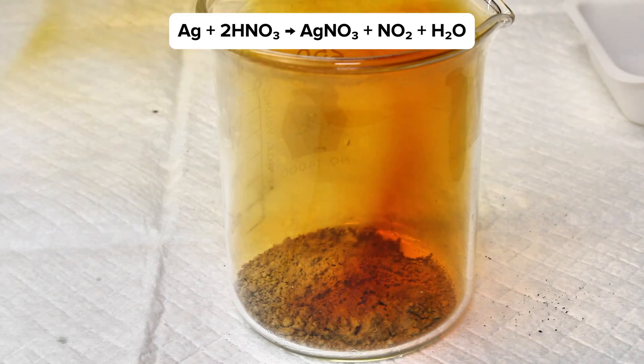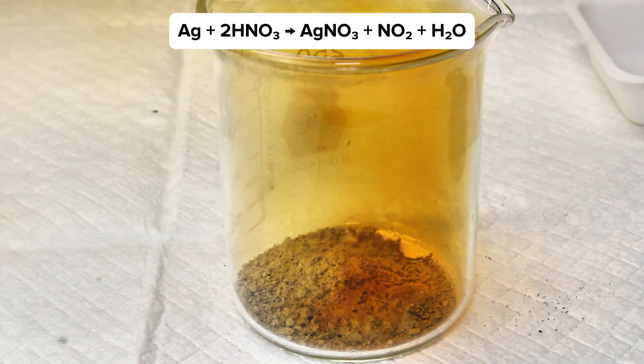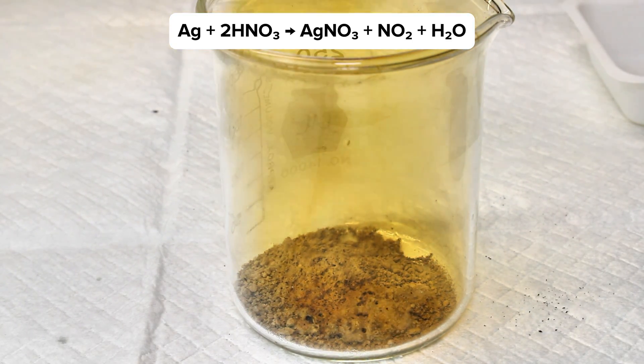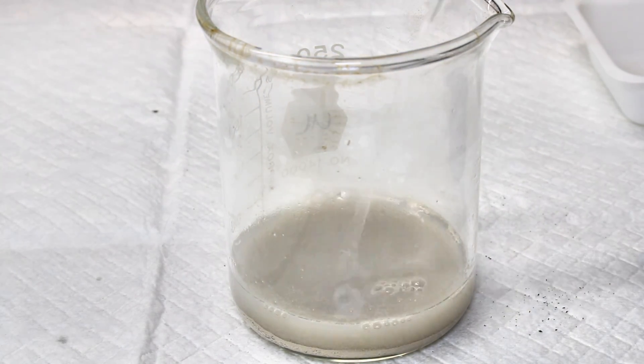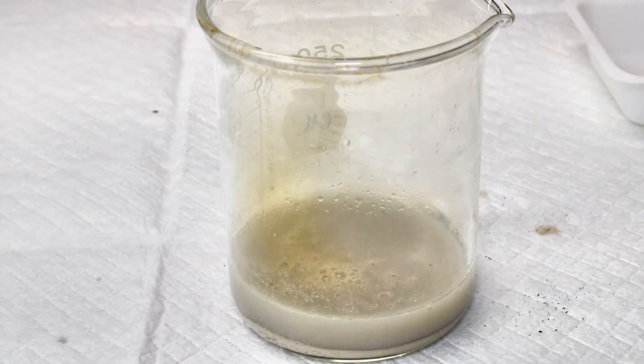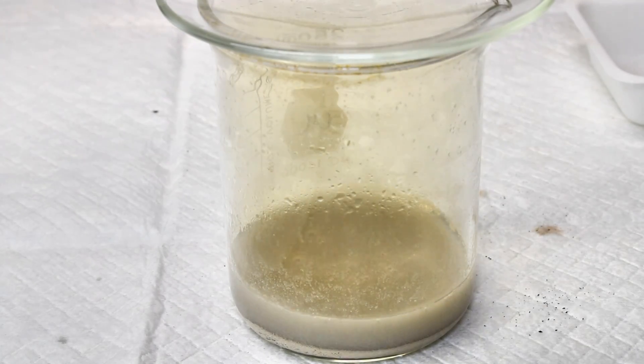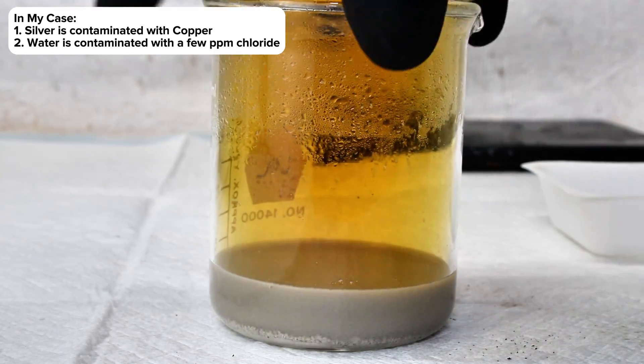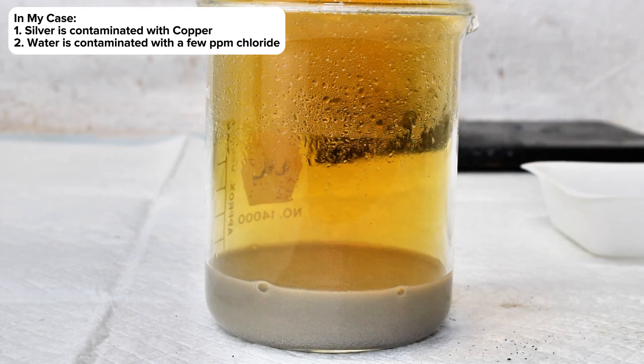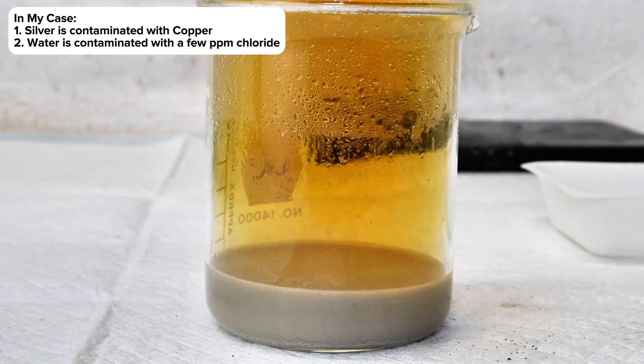If you happen to have access to lab-grade silver and nitric acid, this process is a good deal easier as silver is extremely sensitive to impurities. In my case here, however, I used silver powder that I precipitated from a crude solution of silver nitrate using copper metal, and so there is a tiny amount of undissolved copper still present which will discolor the solution a light blue and need to be removed later.